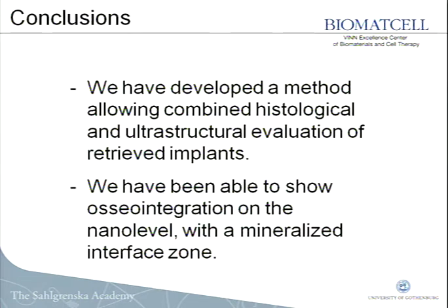So the conclusions: we have developed a method allowing high-resolution analysis of the intact bone implant interface. It could be used for retrieved implants from humans, and it could be combined with histological analysis, so we can get both the microscopic and nanoscopic evaluation of the implants.